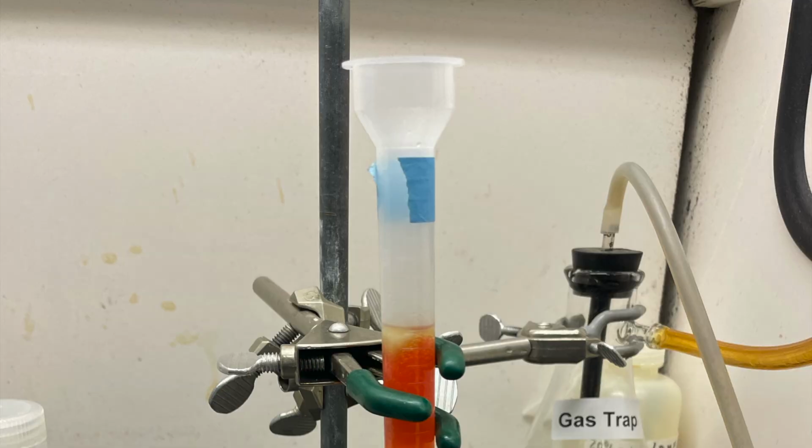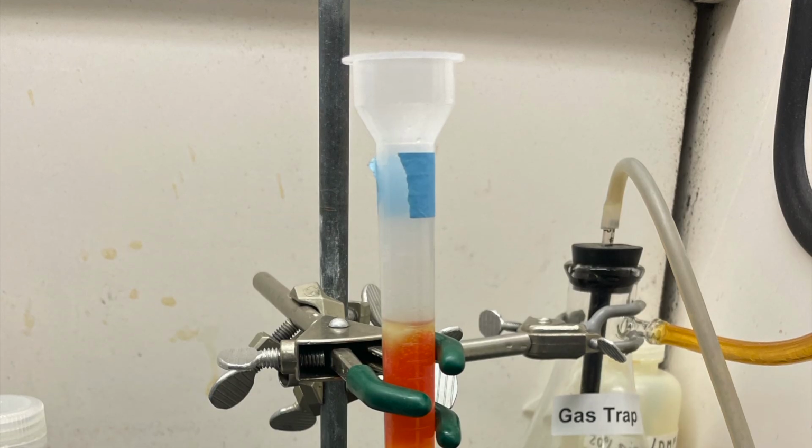The resin acts as a scaffolding where you can elongate this peptide, and once you have elongated as much as you want, you have the protein you need. You can then chop it off that scaffold, and then you have the protein by itself. That's what you can see in this picture.